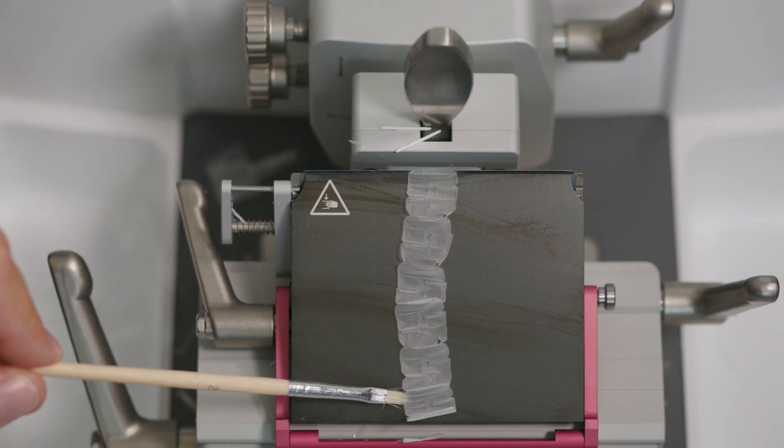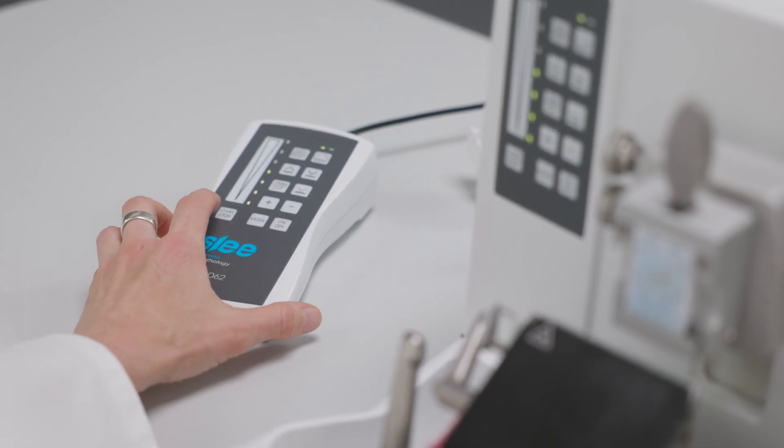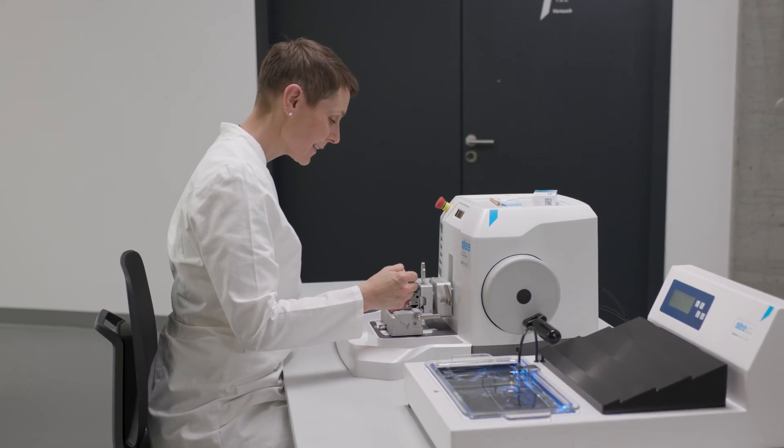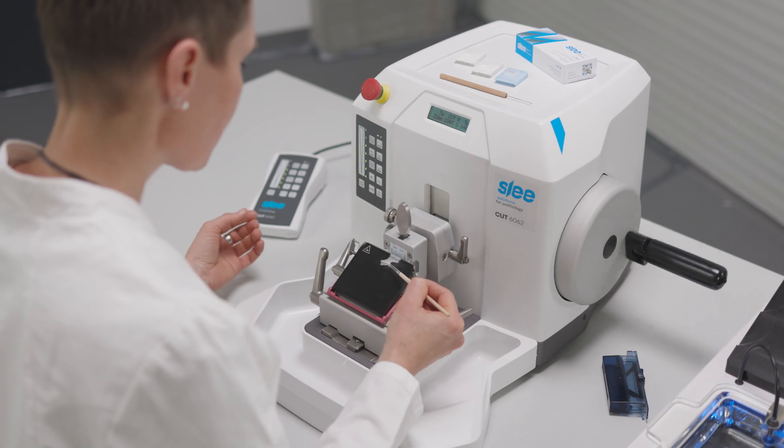The manual hand wheel makes sectioning easy and precise. But you can also let the motor do the work for you. Slice after slice, you can rely on a very high output.